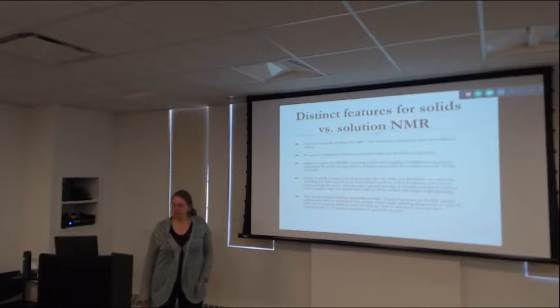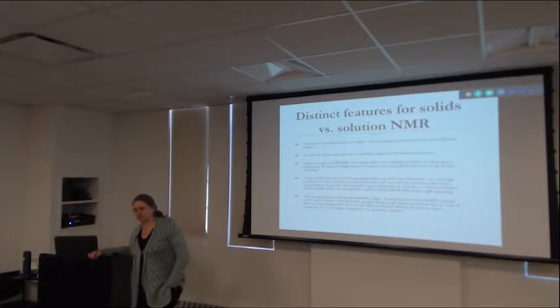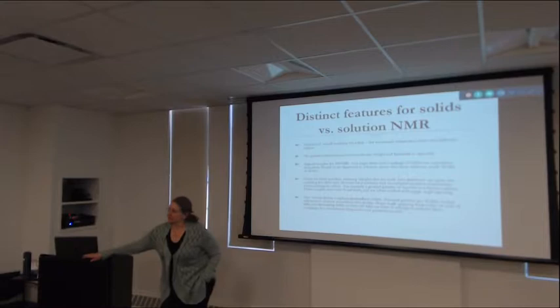And by the way, when I say strong, we have a tendency, I think all of us instructors have a tendency to say fast, slow, strong, weak. And it's important to always remind you what the values are, so you start to get a feeling for the order of magnitude. When I say these dipole couplings, a nearly infinite network of dipole couplings in solids, are strong couplings, let's talk about some numerical values.